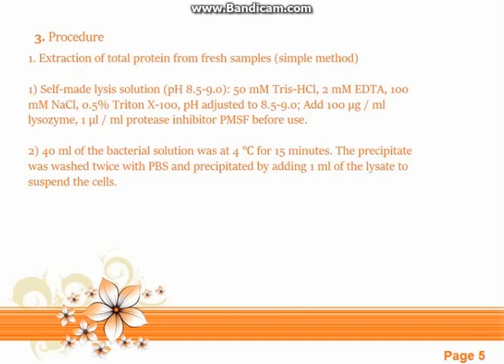2. 40 milliliters of the bacterial solution was centrifuged at 4 degrees Celsius for 15 minutes. The precipitate was washed twice with PBS, and 1 milliliter of the lysate was added to suspend the cells.